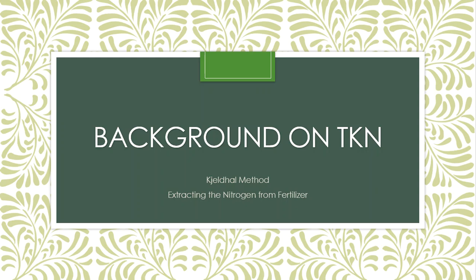this thing and they say, I'm going to do a TKN method. And the K stands for Kjeldahl. That's what that is. So the word Kjeldahl, of course, has to be coming from somewhere across history, from the great and latest scientist that came up with the Kjeldahl method. Mr. Kjeldahl did the Kjeldahl method, believe it or not. Go figure. No one says this is rocket science.